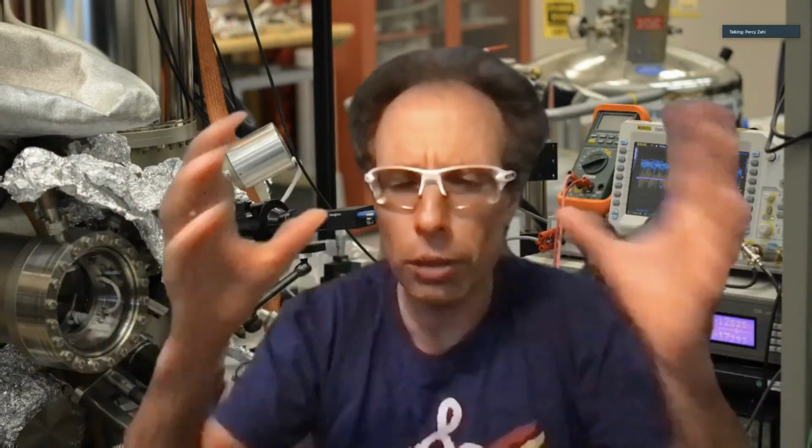That is a vacuum better than in outer space, far away. So something like 10 to the minus 10, actually my machine, if you want a number, the residual gas pressure in there is somewhere below 5 times 10 to the minus 11 millibars, which is very, very low, little to nothing. And inside the microscope, it's virtually nothing because it's in a very cold environment. It's at 5 kelvins and surrounded by 5 kelvin walls. That means if there's anything flying around that sticks to this wall, there is virtually nothing left on my surface. So the surface stays clean once I've cleaned it.